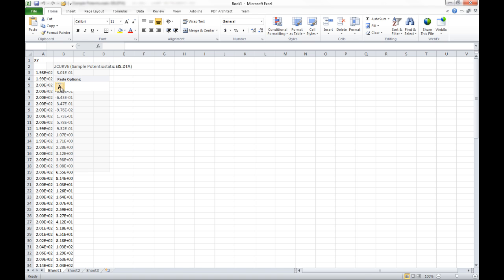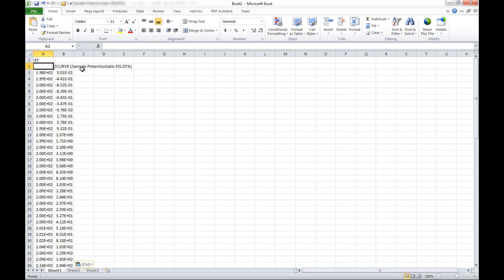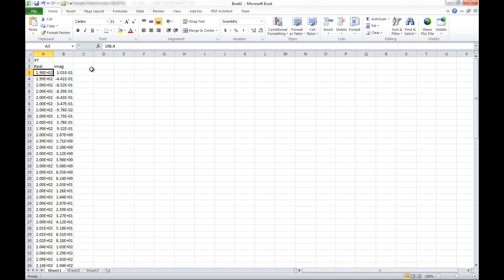So come over here, I click paste, and there are our XY data. In the Nyquist plot we had our real data here and our imaginary data here. We can see how easy it is to export XY data for graphing in another program.